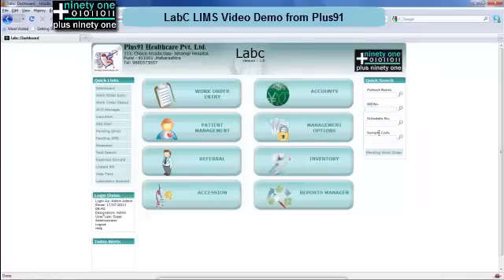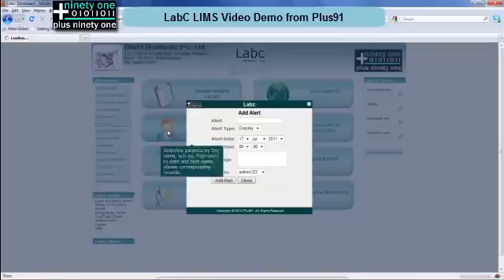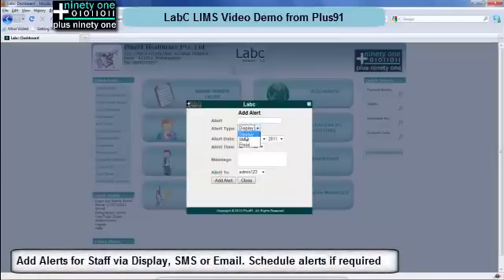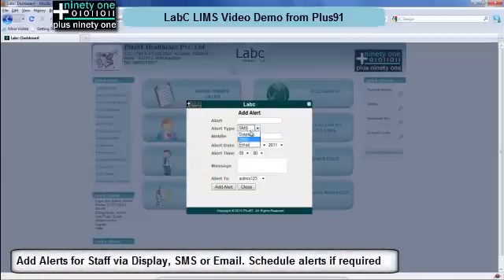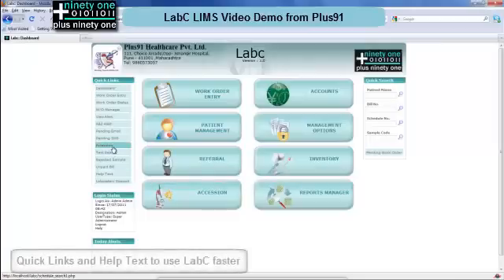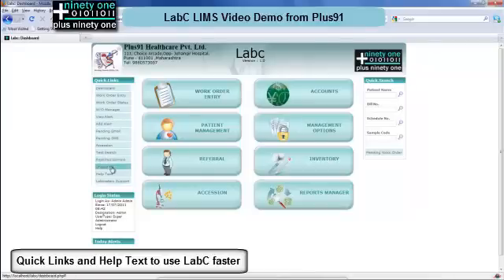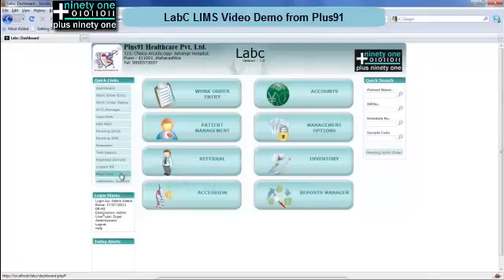Next we have the quick search bar on the right side. You can search by patient name, bill number, schedule number or sample code. You can also add alerts in the system for another user — these can be display, email or SMS alerts. You can select the user and type in the message, and at a given date and time the display, SMS or email alert will go. For SMS and email, internet is required. Next we have the help text bar where you can define all the rollover text that you would like to show your user.